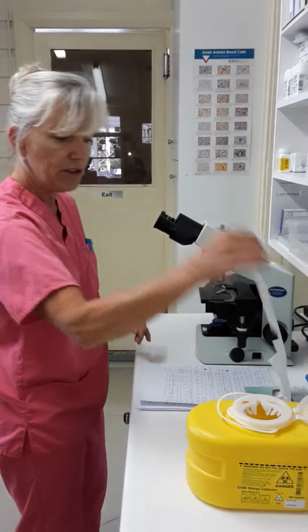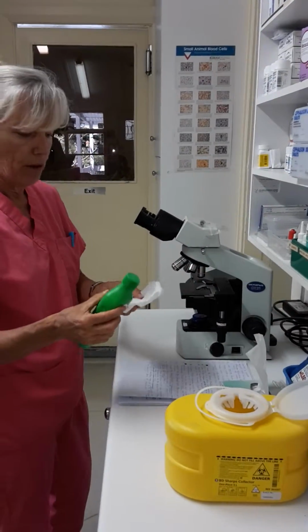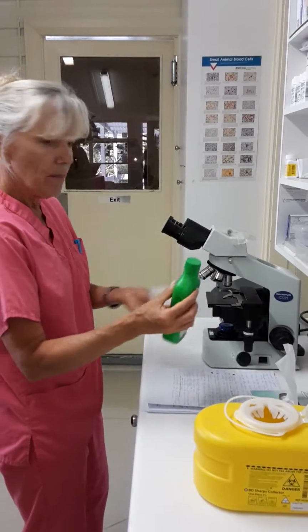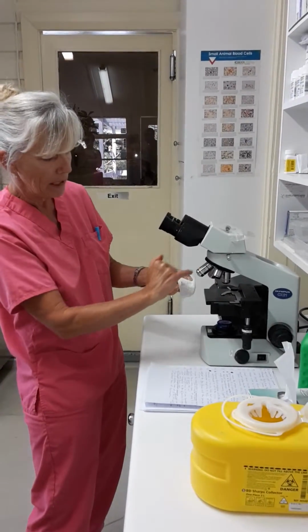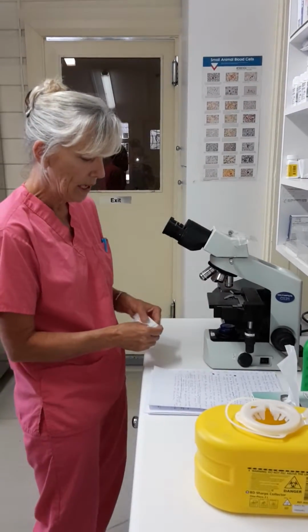Our clinic protocol is to use Kimwipes, which we would soak slightly with our hard to say word, isopropyl, which is alcohol. My colleague has just done this, so I'm not going to do it again, and I'm not going to risk damaging the expensive equipment. But what we would be cleaning is our objectives, our stage, and our area down the bottom here.